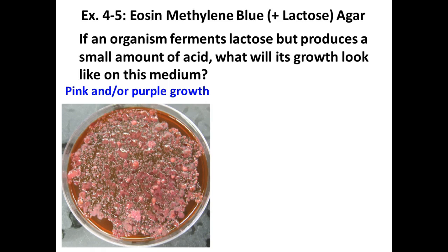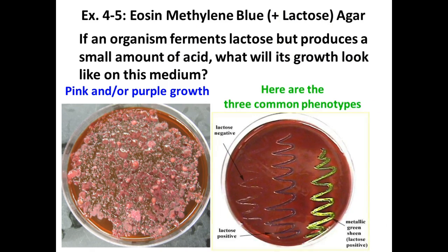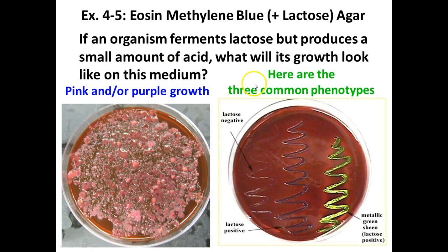Give you an idea of the kind of coliforms that could be present in that if you don't cook it all the way. And see, that's showing the metallic green. Here's one that's showing kind of a purplish color. And this one, it's kind of blending in with the plate, but you'll see growth. And that's because it's a non-fermenter.